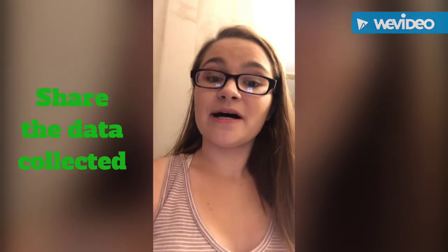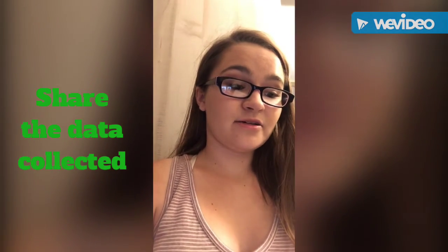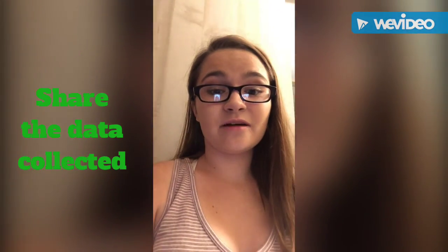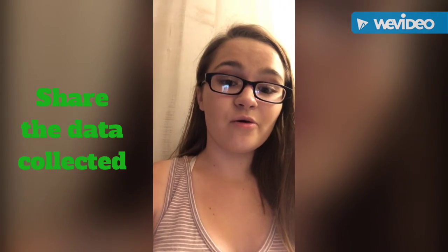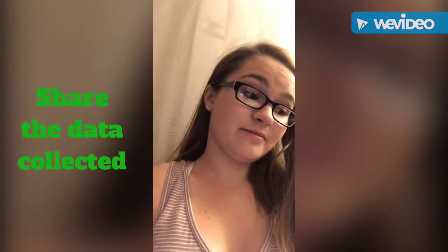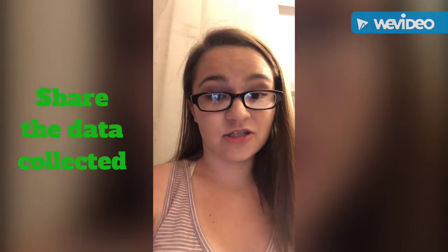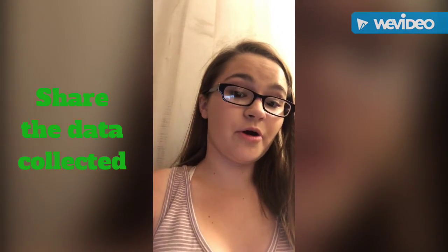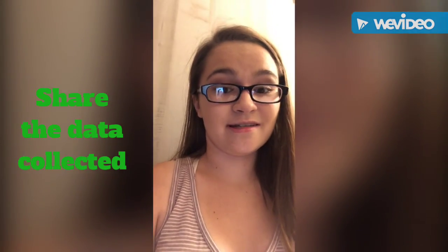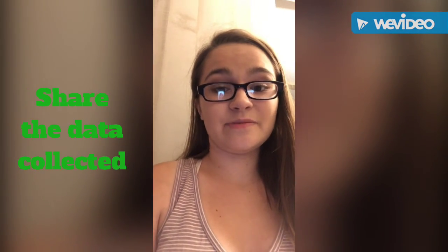So that concludes my science experiment for the virtual 4-H science fair. And what I learned is absolutely crazy. I've had all of these animals, and I've never really known how much bacteria they have in their mouth. So, if you got bitten by one of these animals, you could get a serious infection, because some of these bacterial growths that I saw over the past 5 days have been absolutely crazy. But it is really, really cool to see all the bacteria growing in these Petri dishes.